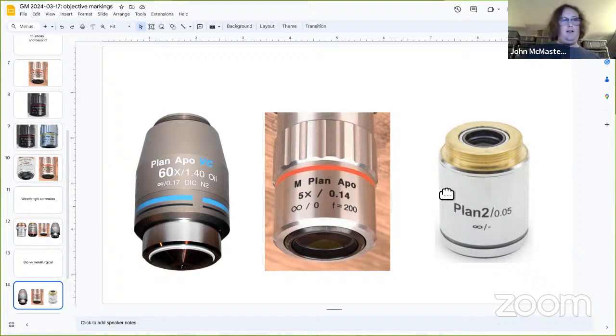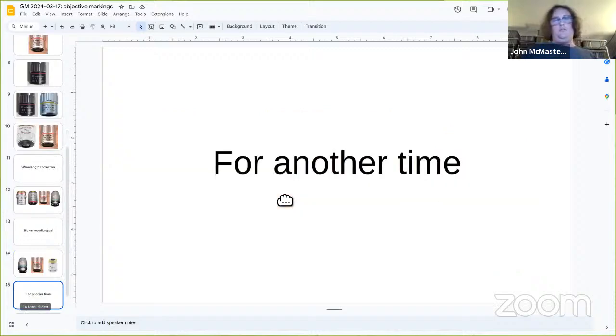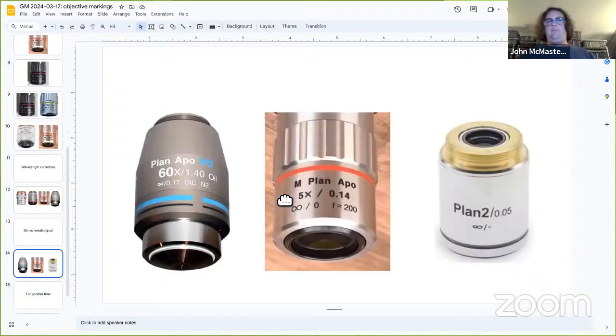Cool. I'm trying to think. I think that might be the core material. I can talk a little bit about what these numbers don't specify, if that's a good closing point to just kind of add to the thought cloud, unless you had another question or thought before then.